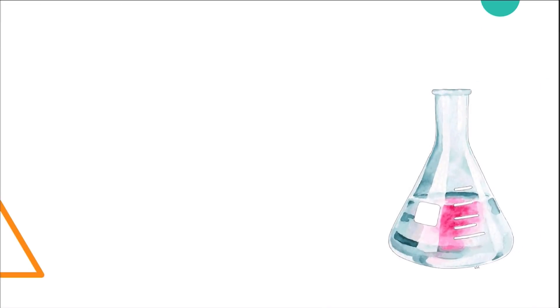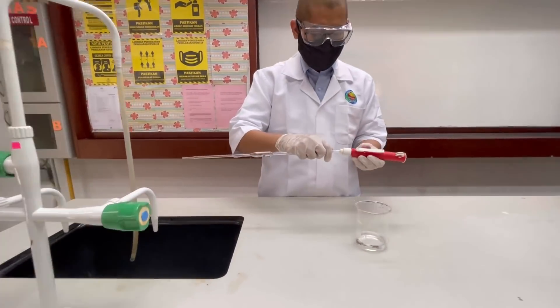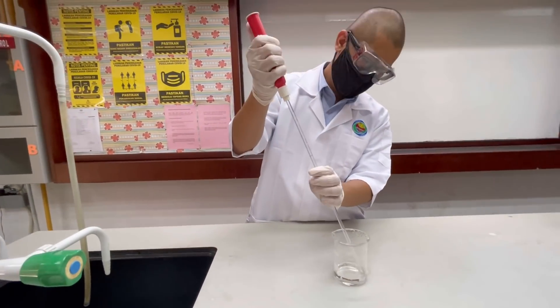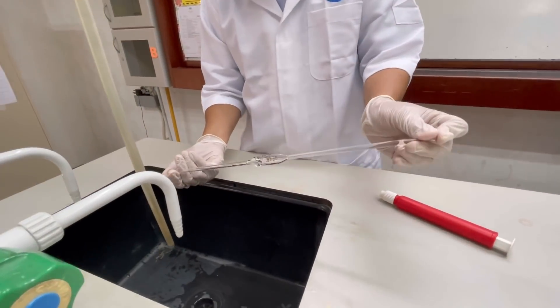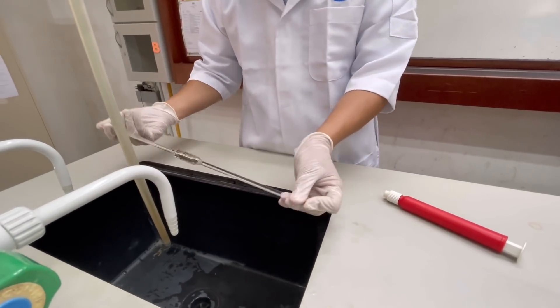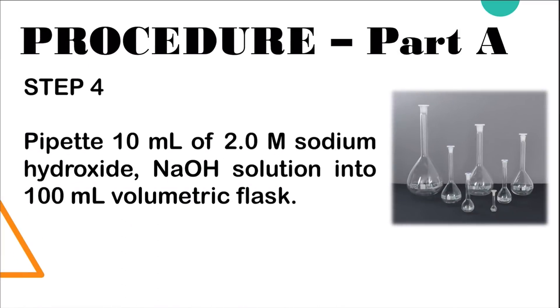Part A, Step 3: rinse the 10 ml pipette with 2.0 molar sodium hydroxide solution. Step 4: pipette 10 ml of 2.0 molar sodium hydroxide solution into a 100 ml volumetric flask.